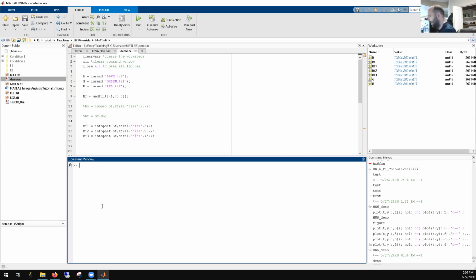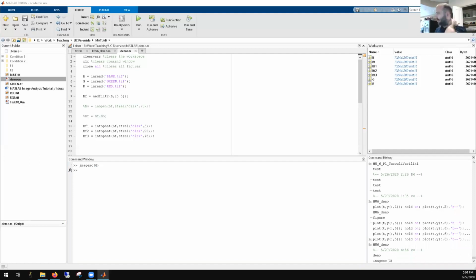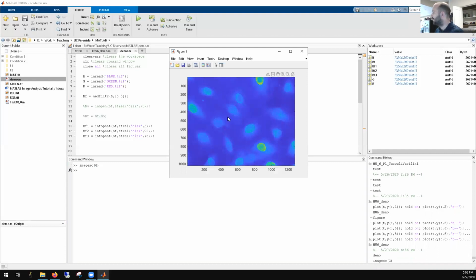So let me pull up G, and so this is our G. So this is green. And this is from my PhD. And you can tell that this is from my PhD because the image quality is really, really low. And honestly, our cameras weren't that great back then. Nor has the microscopy improved too much. We've been at the optical limit since probably the 70s in terms of glass quality and lens quality and everything. But camera quality has dramatically improved over the last 2 decades.